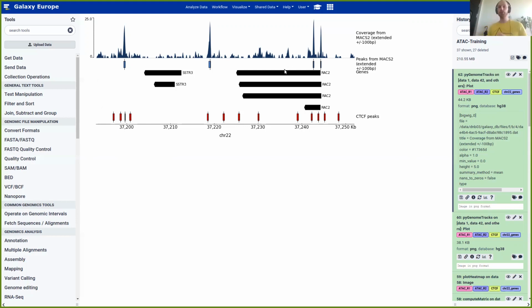What you would do now is to figure out what they correspond to, what kind of regulatory element that is. So you will look for maybe other transcription factor regions, maybe histone marks or methylation sites, something like that, to confirm that this is a valid open chromatin region, or a closed chromatin region, to disconfirm it, so to say it's actually a false positive here.